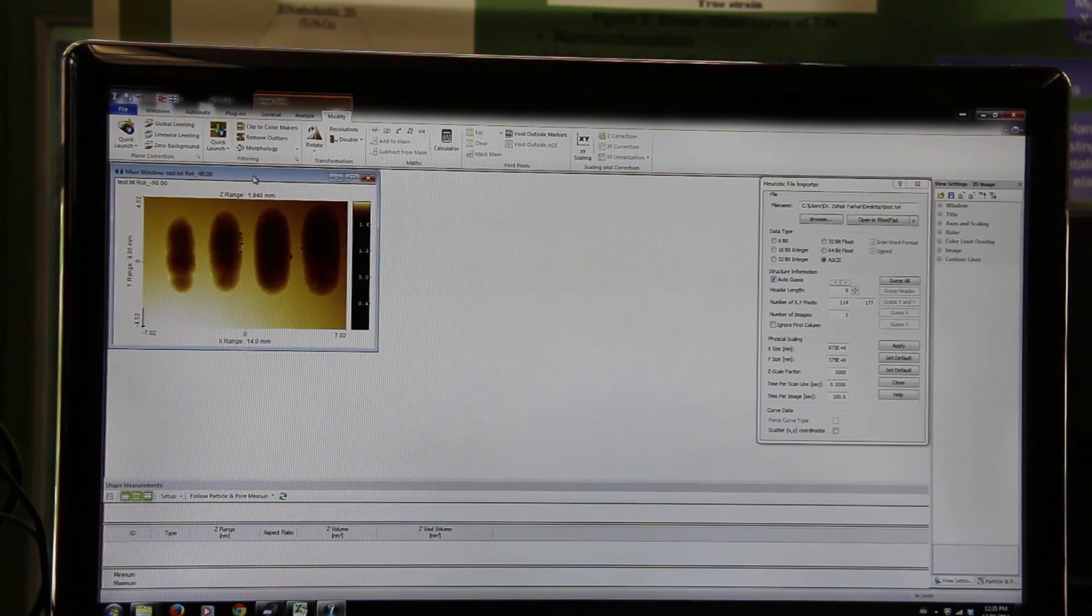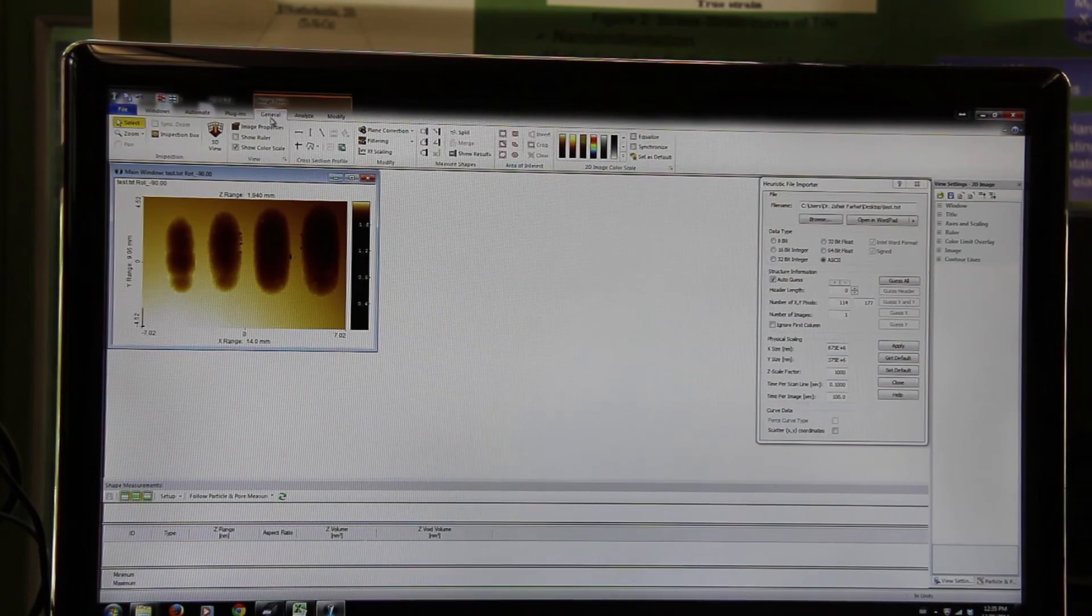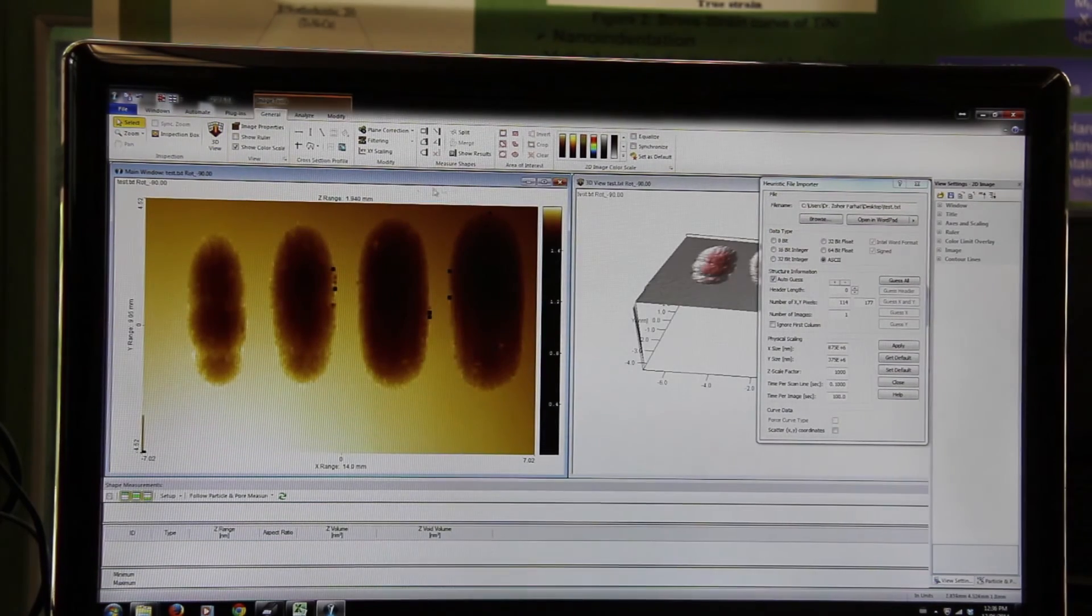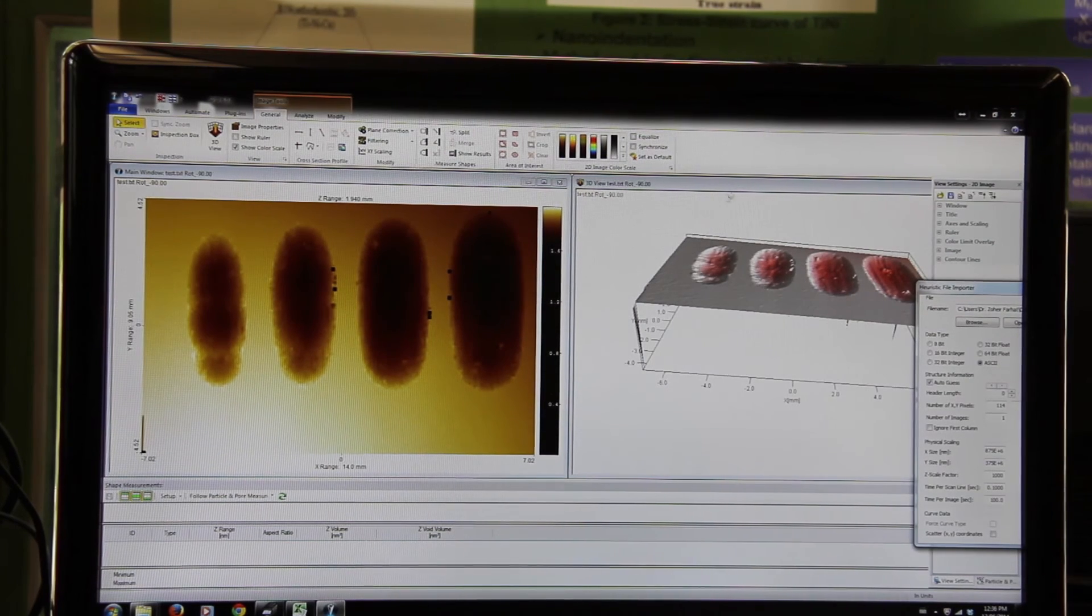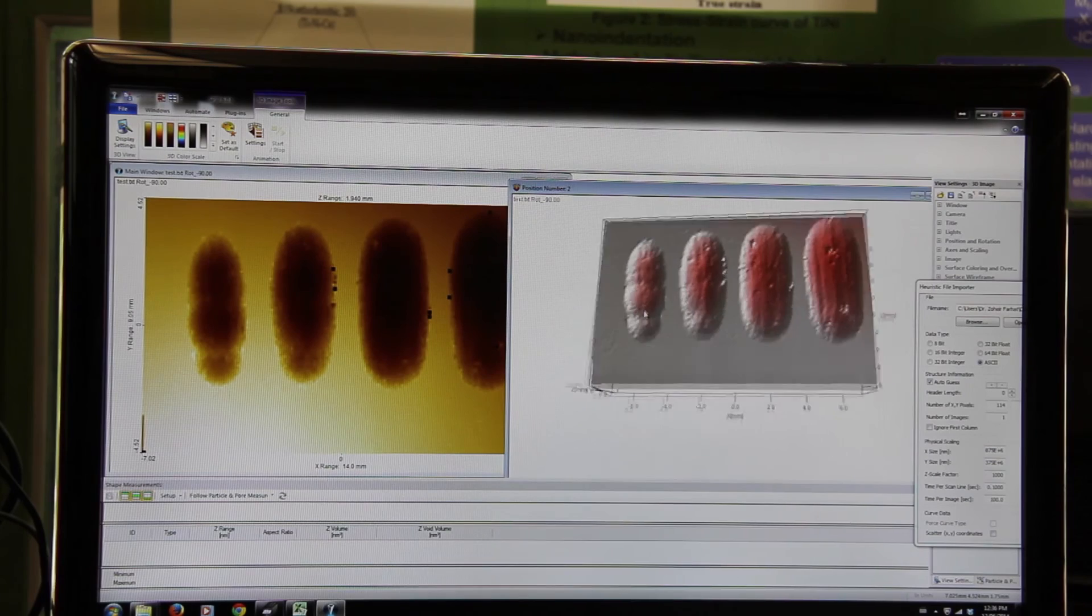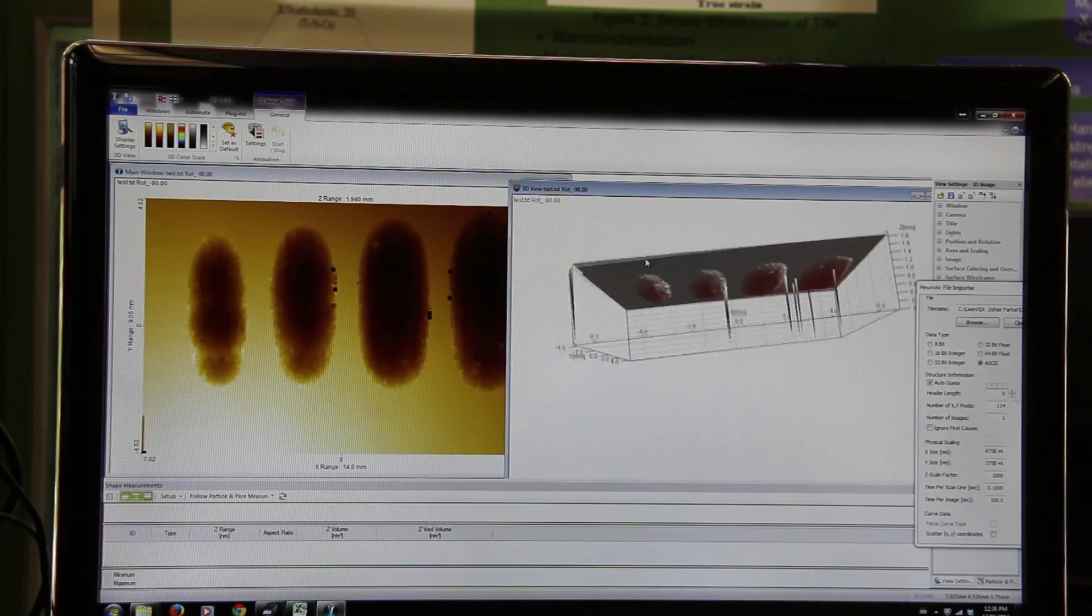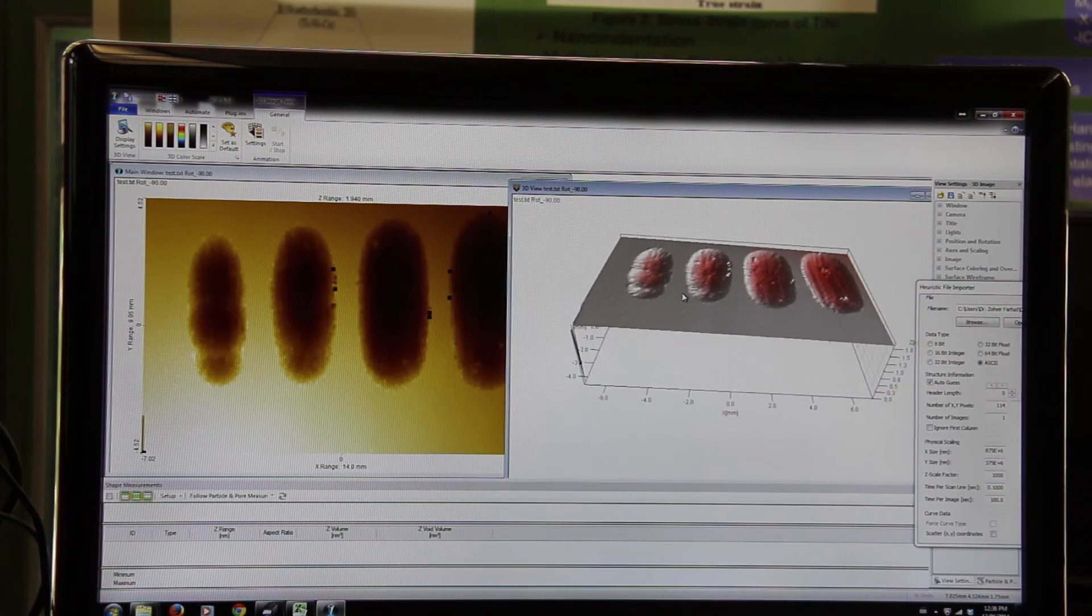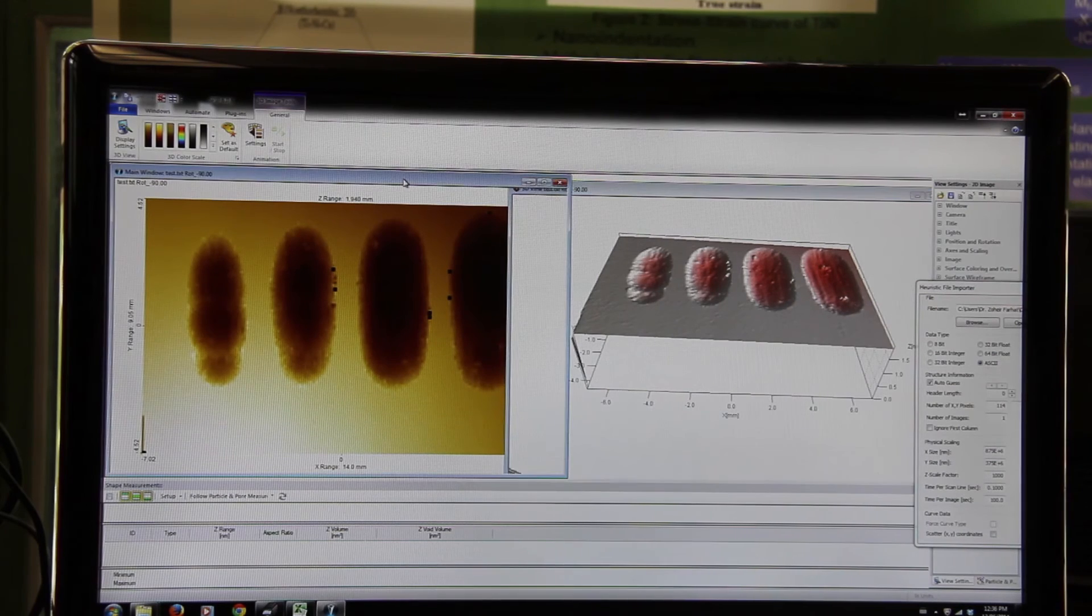In order to see the three-dimensional image, go general and then hit a 3D view. It will give you a three-dimensional view of our sample. But you can see there are some spikes in here.